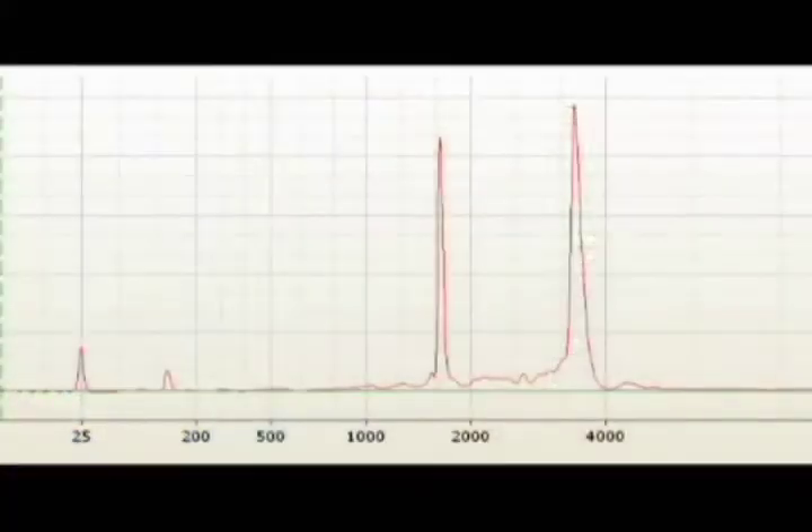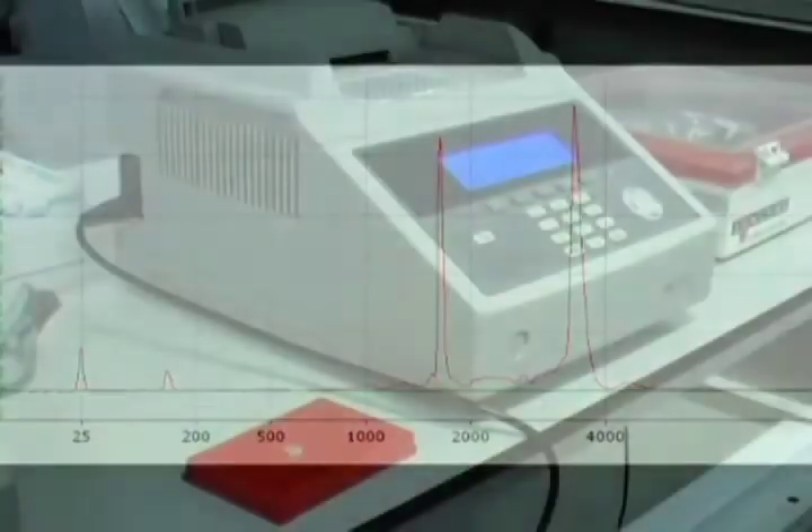Two large ribosomal RNA peaks indicate good quality intact RNA, suitable for further gene expression study by real-time PCR.